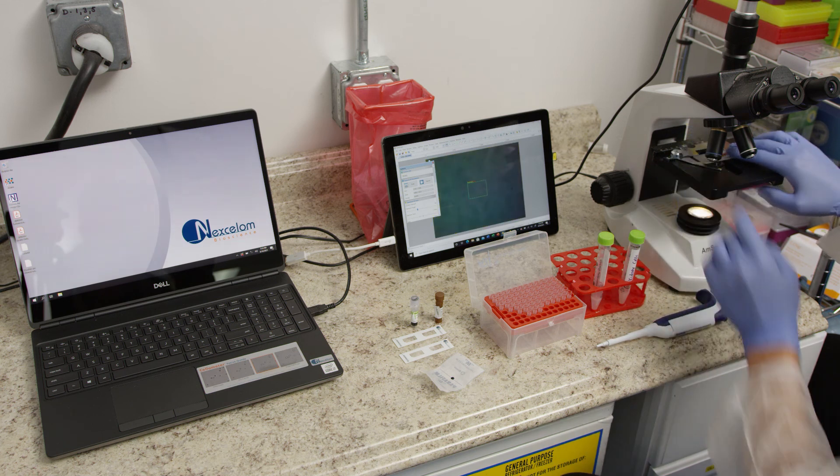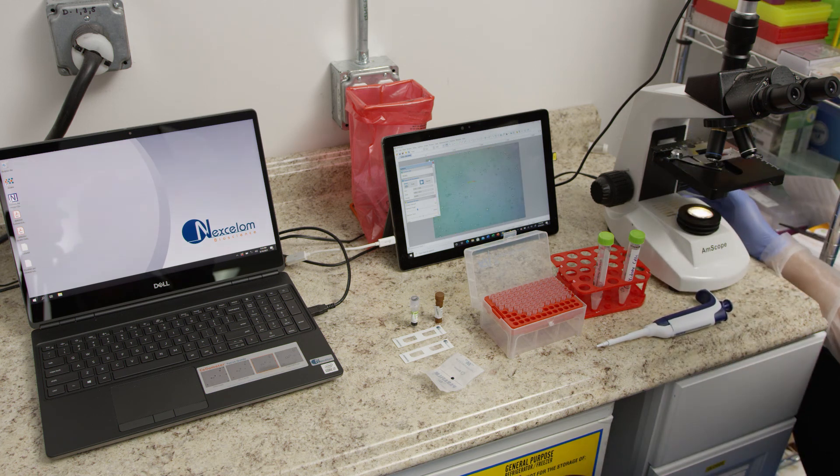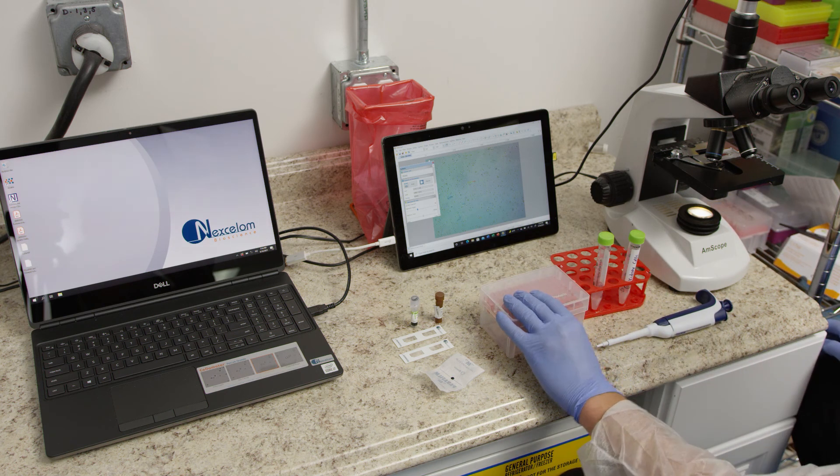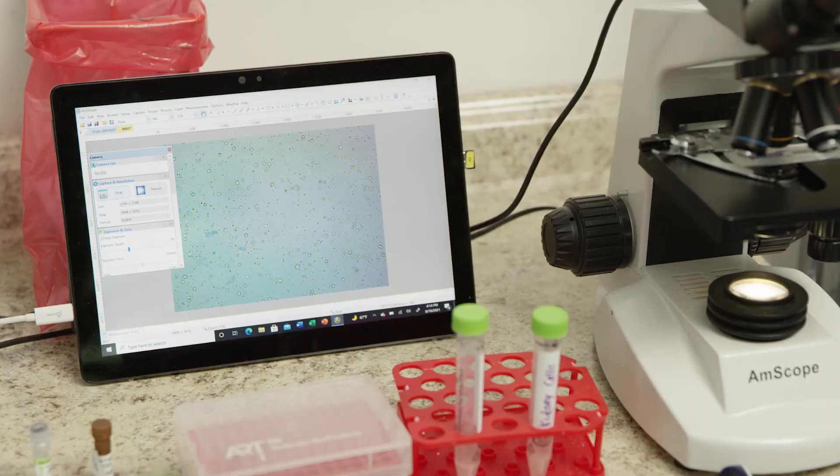Look at the cells under a microscope, then place on an automated cell counter. Adjust the analysis parameters to count objects greater than 4 microns.